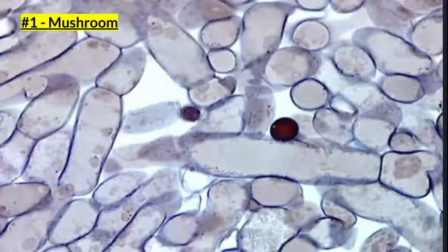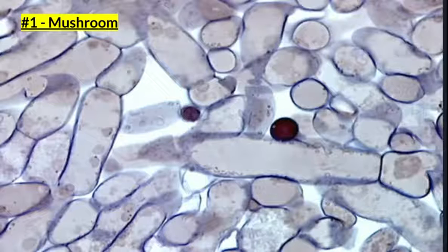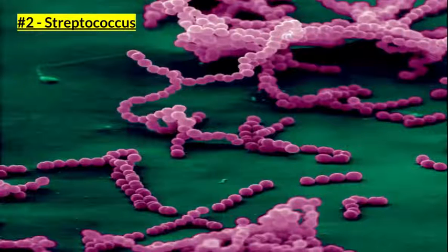I'm not going to go over this too much with you guys, but I'm going to show you each of the pictures. This is a mushroom. A couple things you can do. I can see by this picture there are multiple cells next to each other. So that tells me it's a multicellular organism. Most of the cells seem to be a little more box shaped, and they have kind of a thick boundary around them, which might indicate there's a cell wall. Mushrooms do have a cell wall because they're a fungus. So those are things you'll be doing.